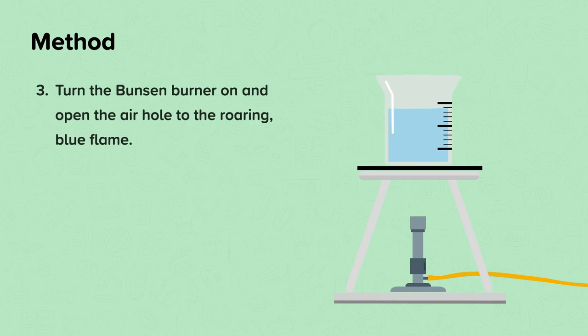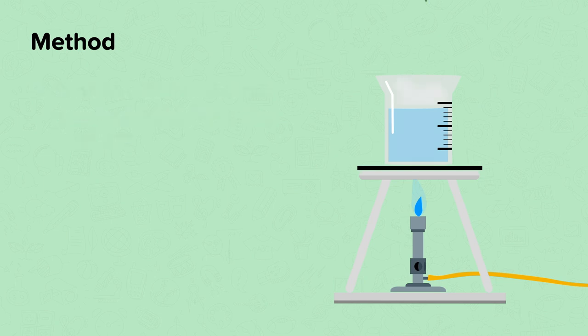Step three, turn the Bunsen burner on and open the air hole to the roaring blue flame. Step four, heat the water until it is boiling.